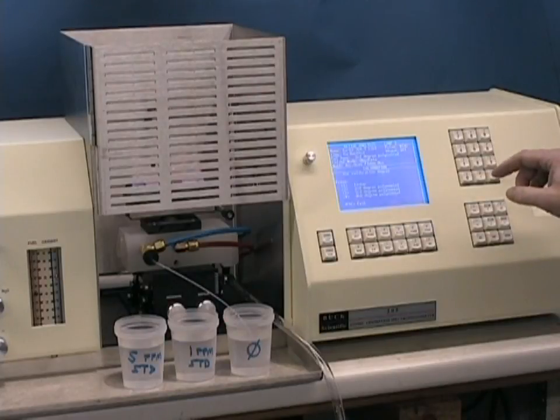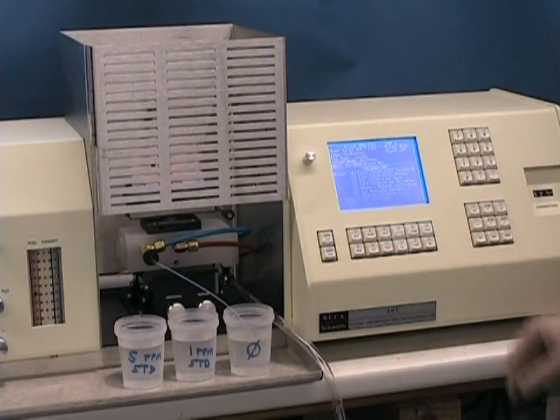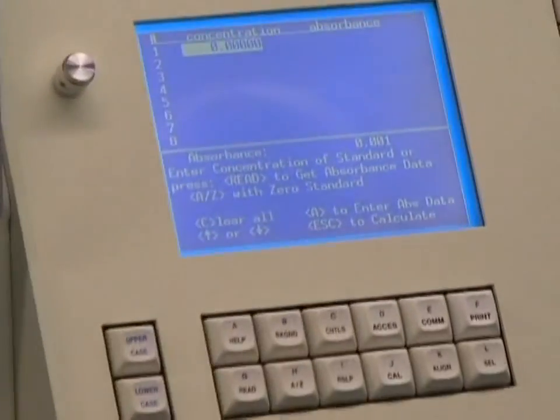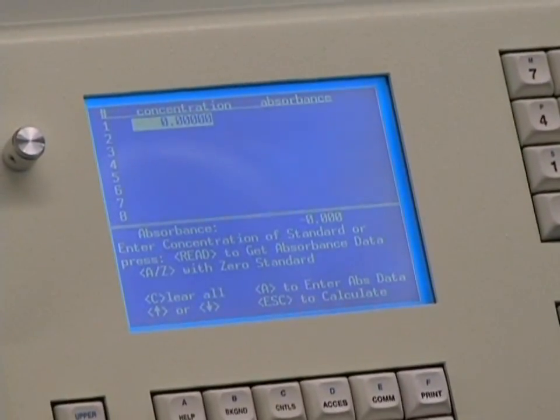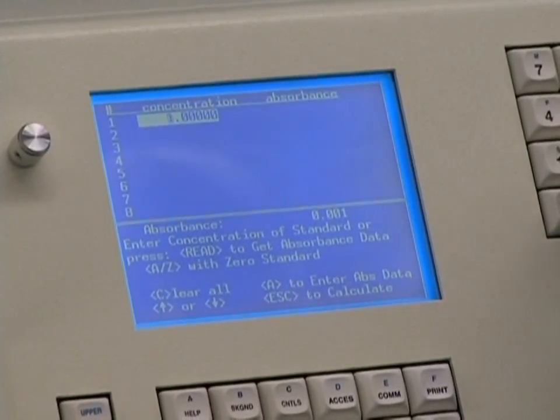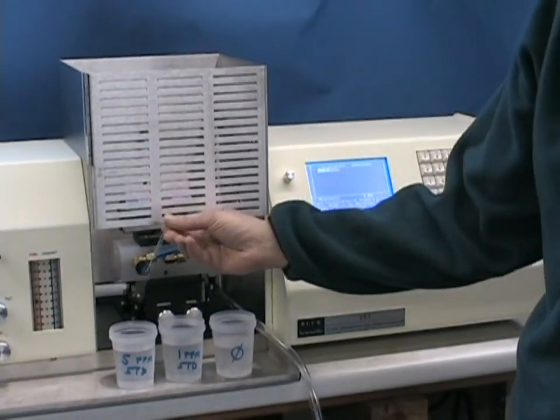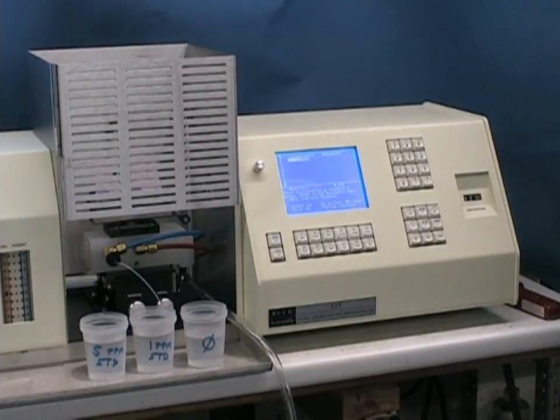Press option 3 and select either a first-order linear or a second-order quadratic if you have multiple standards. Linear and first order are acceptable for most government and analytical work. Then press option 1 to select your calibration values. Press enter to enter the concentration mode as opposed to the absorbance mode and you will see the first line highlighted. The 205 uses a fixed decimal point notation, so using the cursor arrows scroll over to the decimal point and enter in your first standard — in this case 1.0 — and press enter. Then aspirate your 1 ppm standard, wait a few seconds for it to equilibrate, and press the read key. This will take a several-second integration and put the value in the absorbance column of your calibration table.